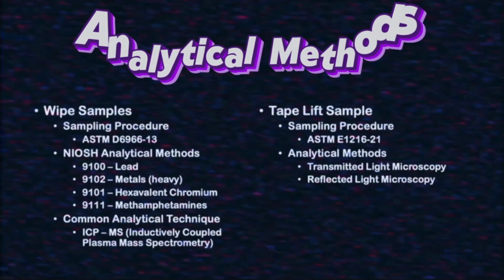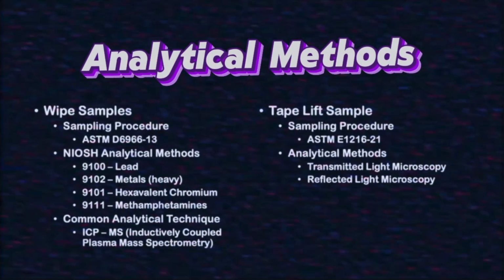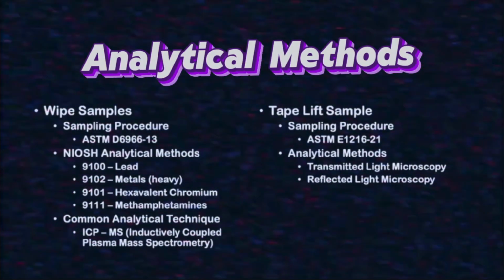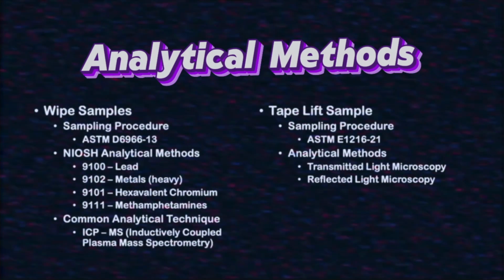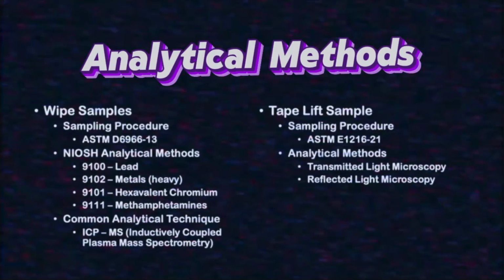Once collected, samples are submitted for laboratory analysis. Wipe samples collected following ASTM D6966 procedures may be analyzed using different NIOSH methods depending on the contaminant.